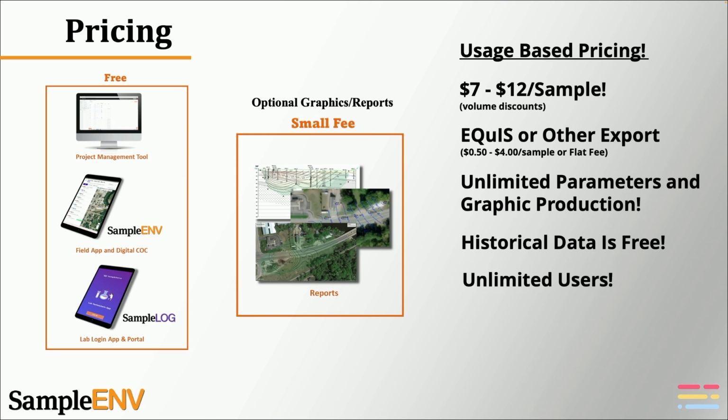Also, there is no per user fee. You can have as many users as you like. Our theory is, more users means more samples. Everyone in the company can have an account. There are no other fees. There's no startup fee, there's no monthly fee, there's no annual fee. We only charge for new samples collected going forward on that project.